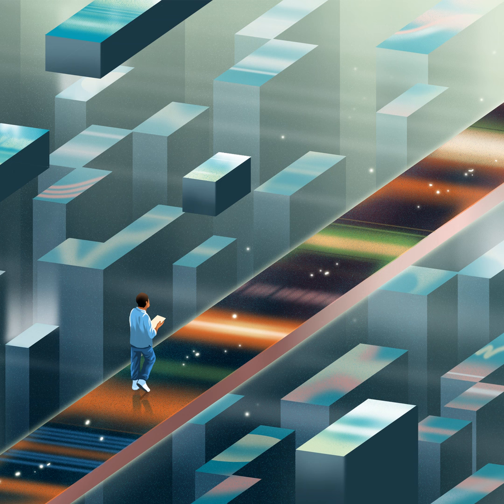Still, short-read sequencing has its limits. Because it typically reads sequences of only 150 base pairs or shorter, these pieces must be computationally stitched together to create a larger stretch. It can't sequence RNA directly, and it has trouble with repetitive sequences of DNA, which can play an important role in the brain. Highly repetitive protocadherins, for example, come together in different combinations to control neural signaling.